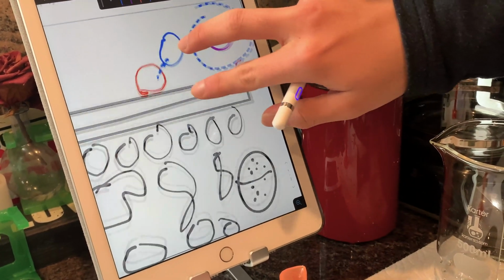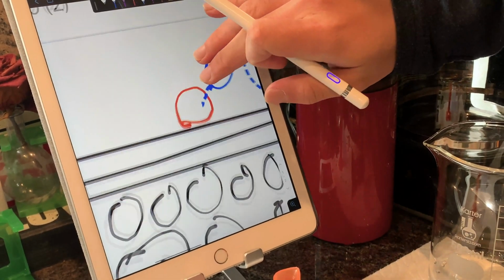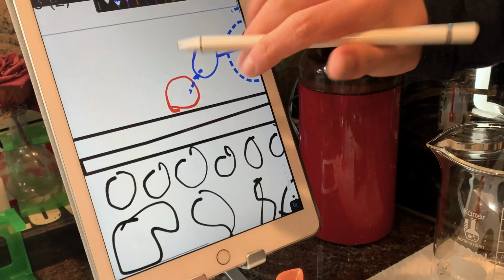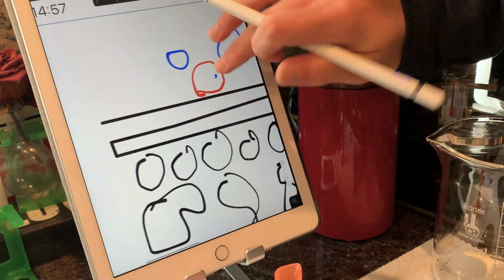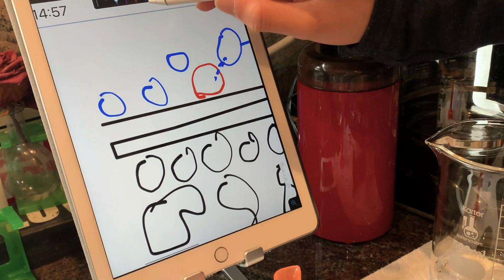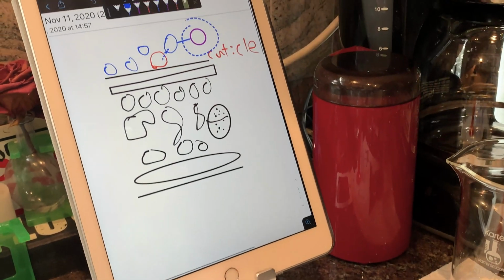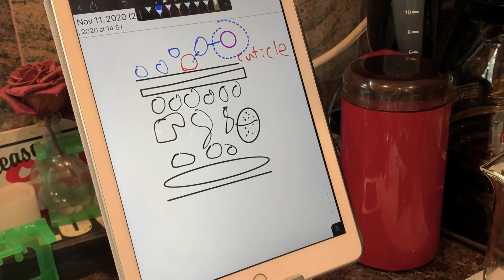And this is only like one molecule diagram, but remember that there will be a lot of soap molecules, and they will all attach to this cuticle, and basically it will form a sphere around the entire plant, and that's what causes the plants to sink.